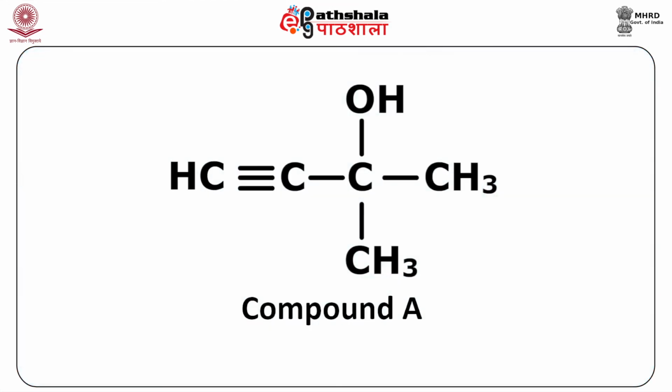Again, to solve the questions, we go in for finding the double bond equivalence. It was found that the double bond equivalence is 2. The peak at 1.20 ppm, a singlet for 6 hydrogens, indicates the presence of 2 methyl groups.